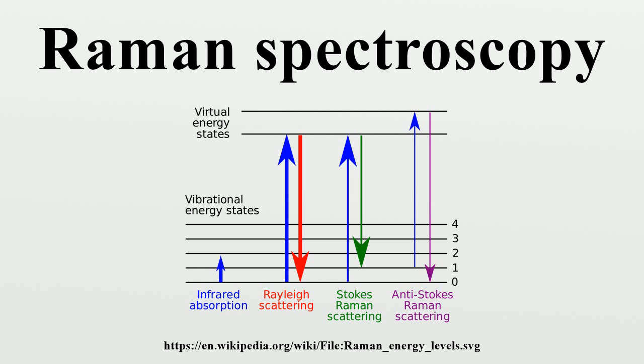The spontaneous Raman signal gives information on the population of a given phonon mode in the ratio between the Stokes intensity and anti-Stokes intensity. Raman scattering by an anisotropic crystal gives information on the crystal orientation, the polarization of the Raman scattered light with respect to the crystal, and the polarization of the laser light can be used to find the orientation of the crystal.